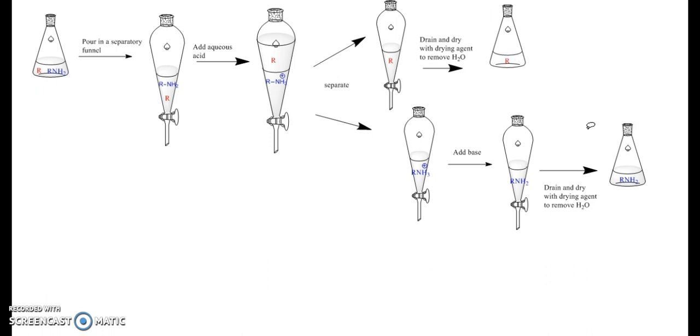At this point, what we do is we transfer both of our fractions, depending on where they are, to dry. And we transfer them to erlenmeyer flasks, and both of them are going to be contaminated with small amounts of H2O, because some of our aqueous layer, no matter what, is probably soluble in the organic layer. And there would actually be one extra step that I'm not showing here with our basic compound.